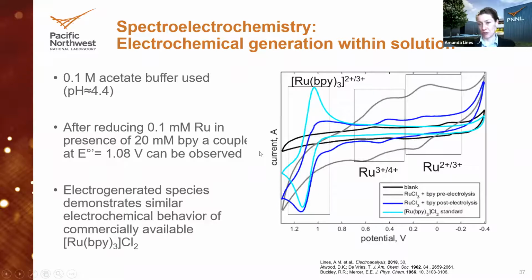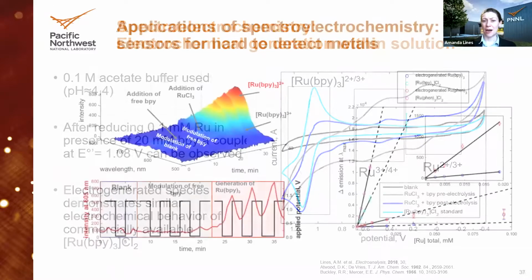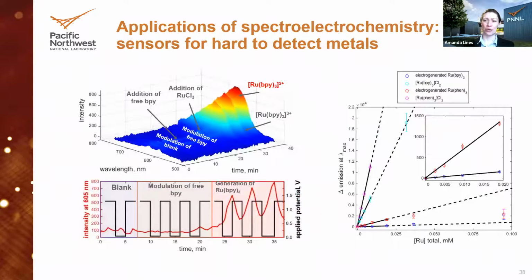Now, this is the electrochemistry part of it, but ultimately we're really after that optical sensor. We need that light output that can tell us, is our ruthenium here? And so here is a demonstration of how this sensor would work. So you can actually see your optical output out here. We're looking at your fluorescence signature as a function of time while we're running this sensor system. And to break this down a little bit easier, we've got a 2-dimensional plot of that same data right below. And this is a double axis plot where we're looking at the intensity of our emission fingerprint while also looking at the potential that we applied to our sensor environment.